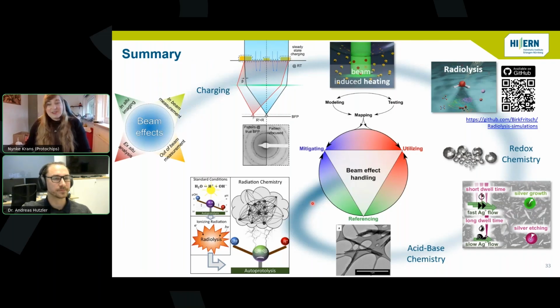Good. Well, the first question that came in was, how do you obtain sufficient signal to noise ratio in EELS for quantitative estimation of radiolysis-induced transient molecules? Yeah, good question. So these experiments that I've shown were conducted by Patricia Abellan at CNRS. They were looking at thin ice films, and they really have to be extremely thin to get a sufficient signal to noise ratio. And even in ice, as far as I remember, there were diffusion effects observed.